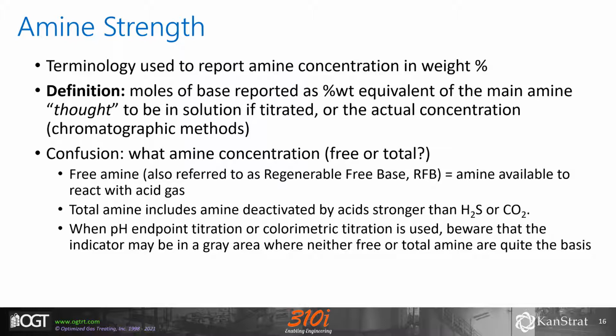Amine strength is a term that is thrown around commonly in the industry, and it's used synonymously with concentration of amine. But it's really a proxy for amine concentration. It's usually reporting concentration in weight percent that's supposed to represent the amine that's in solution. The precise definition is moles of base reported as weight percent equivalent of amine that you think is in solution if you titrated the sample. If you use GC or IC, that's the actual total concentration that's in solution.